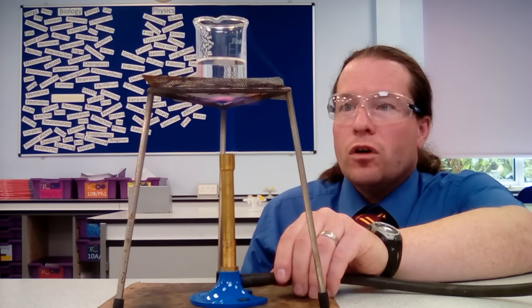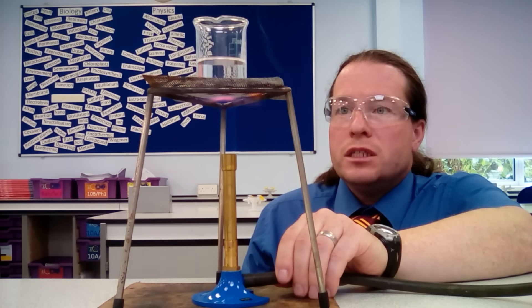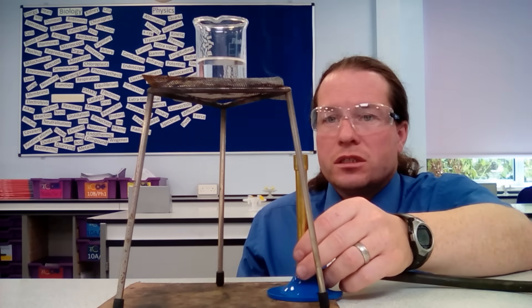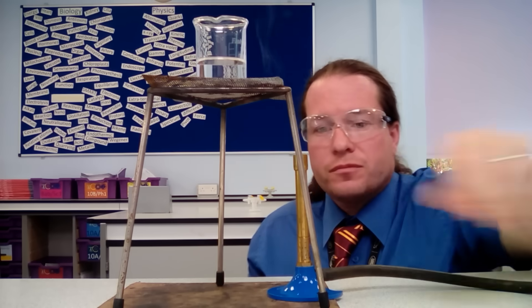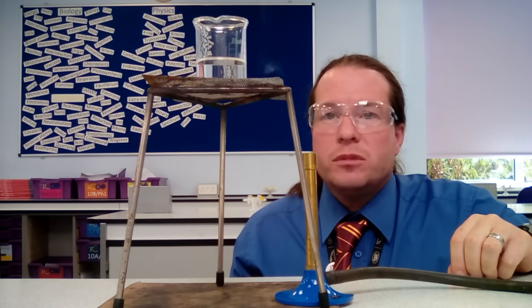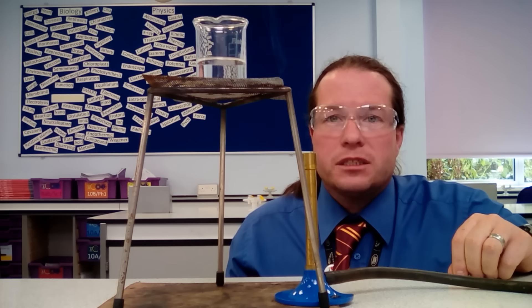We can see bubbles starting to form — that's nearly boiling — so we slide out the Bunsen burner, put it onto the safety flame, and turn off the gas. Now we want to add the copper oxide, one spatula at a time, until no more will dissolve into the sulfuric acid.